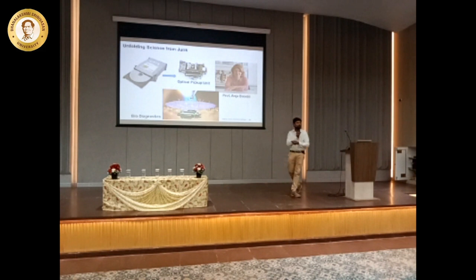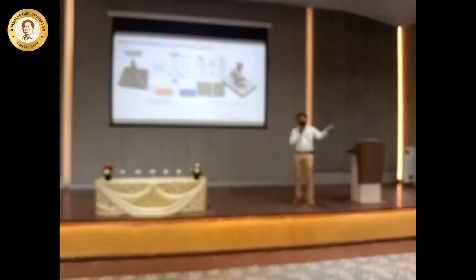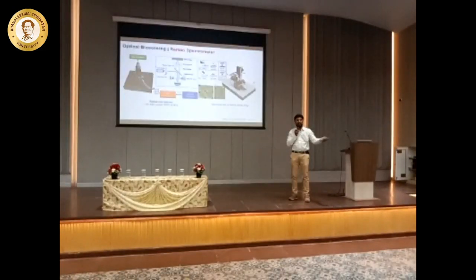There are tremendous works that have been done, not only by this. She's the one who started using this optical pickup unit as a biosensor, but several people have come up with different aspects. They have developed an FT Raman spectrometer. You won't believe it. If you buy an FT Raman spectrometer, it's going to be almost 25 lakhs to 50 lakhs. But can you create it using one CD drive? That's the question. They have created it.